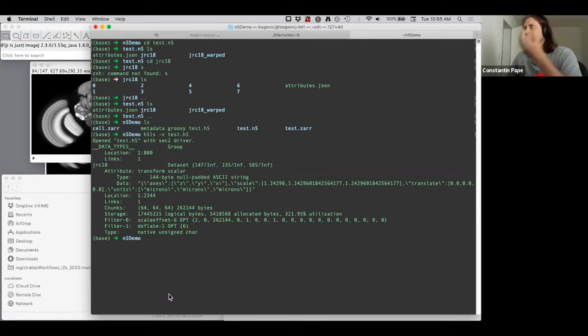You always need the group data, which defines these different scale levels, which then have the array data. But as Davis points out, this means it doesn't really allow you to load an individual image without first looking at the group metadata. And I personally don't find this such a big issue, because it's more like a software question. I don't think you should move things around in there without knowing where they live.